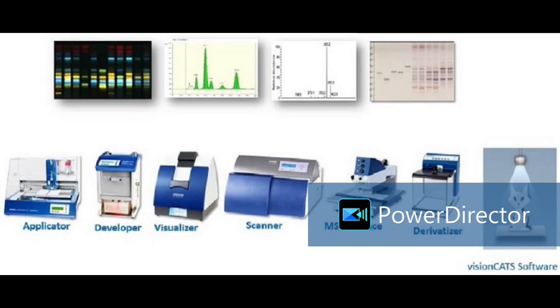Then some pharma applications like dexamethasone, ciprofloxacin from eye drop sample we have detected. Then checking the assay value of framycetin sulfate in soframycin skin cream. Then cosmetic applications, eugenol detection from toothpaste sample.